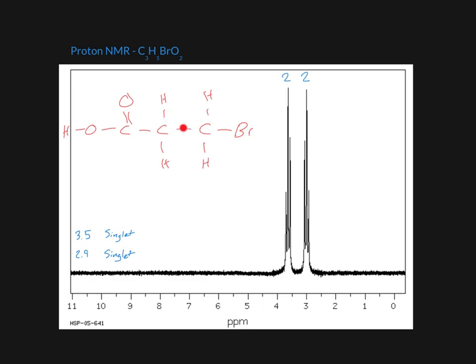Now we have carbon-to-carbon sp3 bonds, and we have our carbonyl here, our double bond oxygen, as well as the overall carboxylic acid from our previous findings. Now as for proton NMR, we do know that both of our environments should have 2 hydrogens apiece.